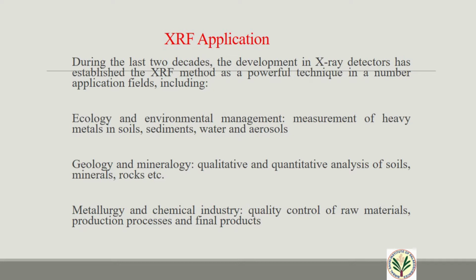XRF can be used in the metallurgy and chemical industry, and for quality control of raw materials, the production process, and finally products.